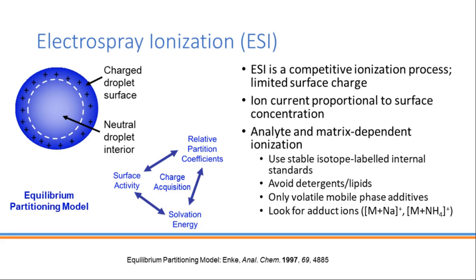And because electrospray is quite soft, adduct ions are not uncommon. So it's not uncommon to see a sodiated or ammoniated ion, so you should be on the lookout for those. It's really very molecule dependent on what kind of ion forms they might take.